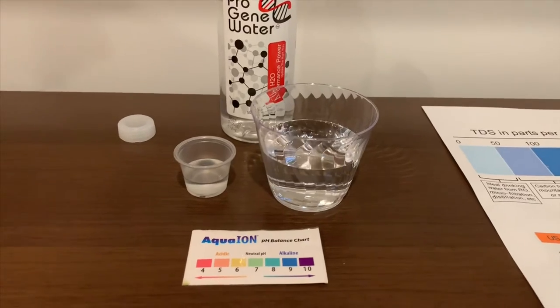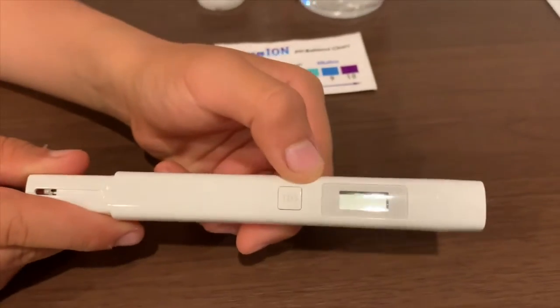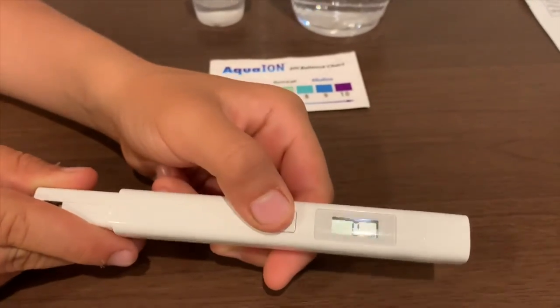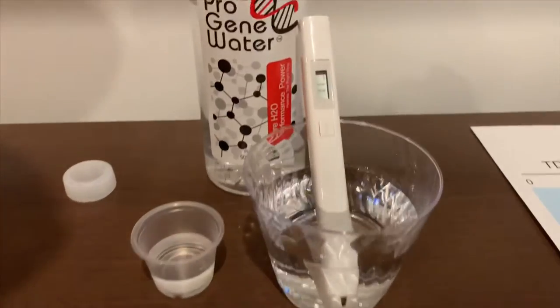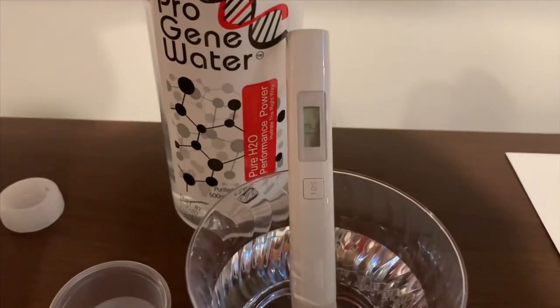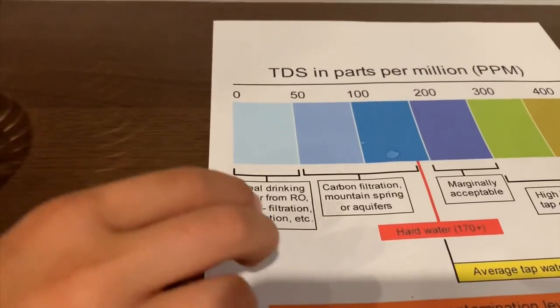Now let's test the TDS. If you want to buy this TDS tester, check the link down below. Turn on the TDS tester, make sure it says 0, and put it in — 12. That is an ideal drinking water.